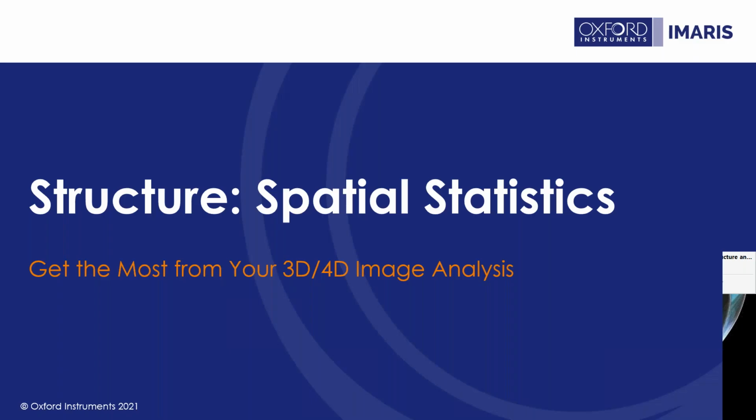So that gives you an overview of what Imaris is offering already, but what are we introducing with 9.7? With 9.7, we are going deeper into spatial statistics. For a long time, Imaris has presented you, as I said before when I was talking about spots, with the number of objects that it's detected in your image and the position of those objects. More recently, we've added measurements for you to understand how far away those spots are from other objects in your image, whether it be a surface or something we call a reference frame.